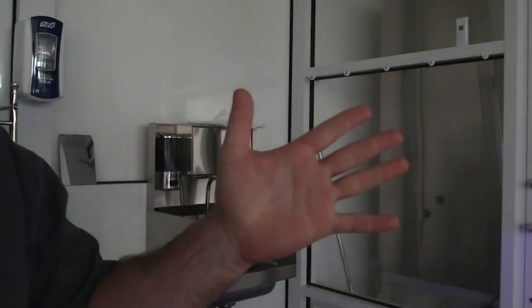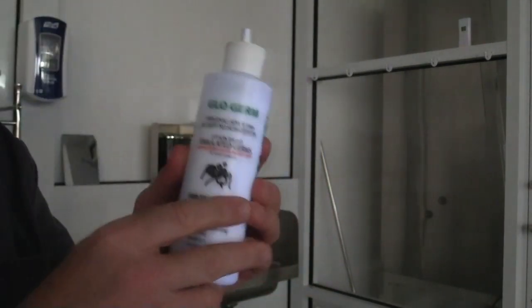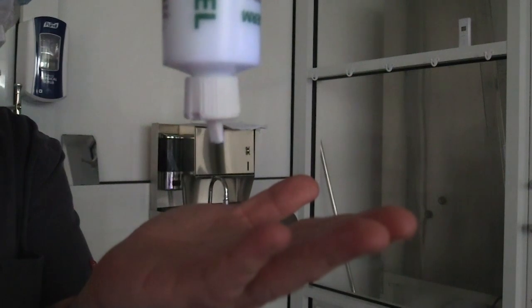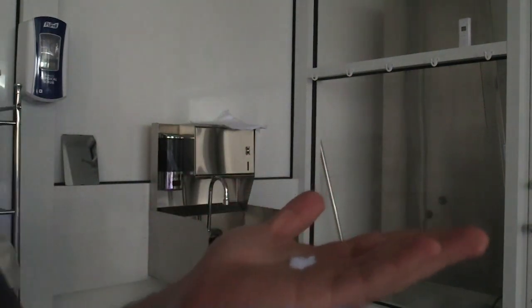Washing our hands seems like something everyone knows how to do, right? In this video, I'm going to use a black light and this stuff called Glo Germ to demonstrate how well I'm actually washing my hands. Hand hygiene when you're compounding sterile medications requires a knowledge of how and why it works, as well as knowing and observing certain behaviors for keeping your hands clean.